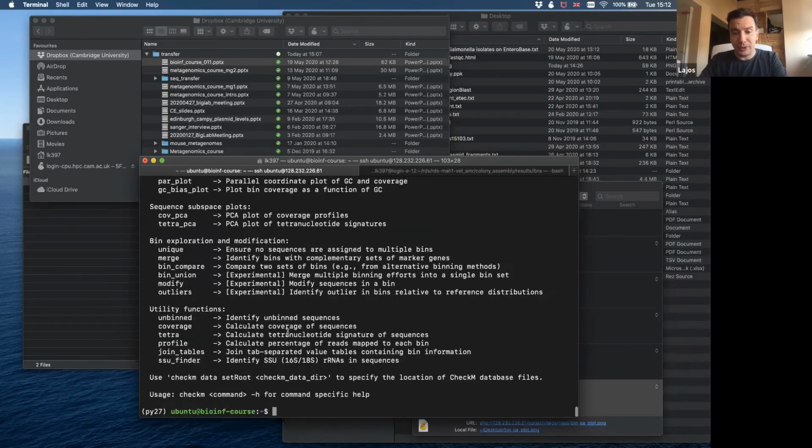So we will do one CheckM run, but I will only ask Joe to do the run, because even if one person is running and using all the CPUs, it takes about 5 to 10 minutes. So I think it's best to start running, and while it is running, I will tell you what it is doing, and then you can understand how this whole program works. So now I only ask Joe to do the things. Go to your Scratch directory.